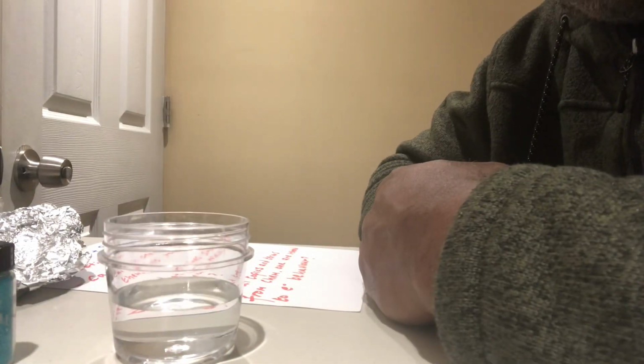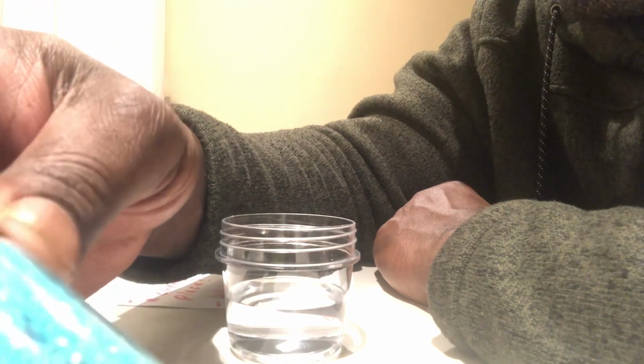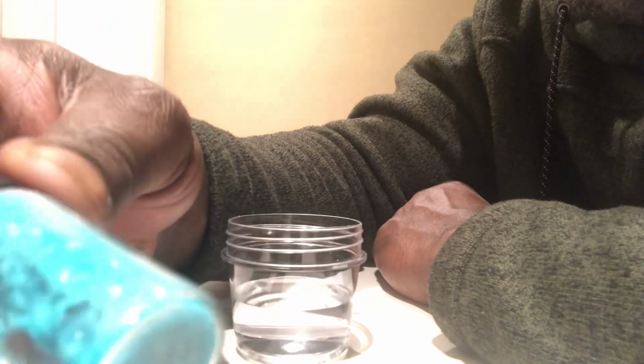Okay, guys, we're back, and we're going to do our simple demo for our oxidation and reduction introduction. So here's the deal. We have some water in this nice container right here. We have some copper chloride. I don't know if you can see this well or not, but it has a nice turquoise type color to it. Funny enough, when I'm looking at it in the camera, it looks more bluish.